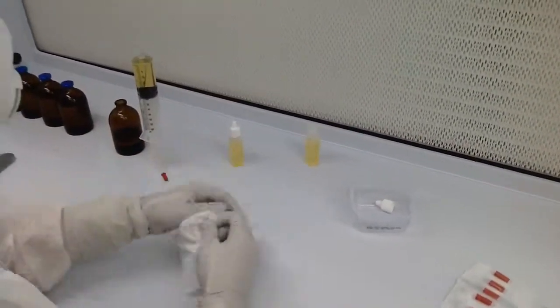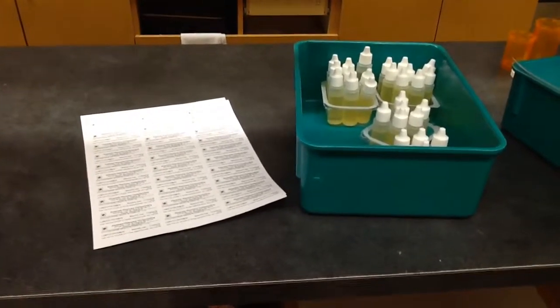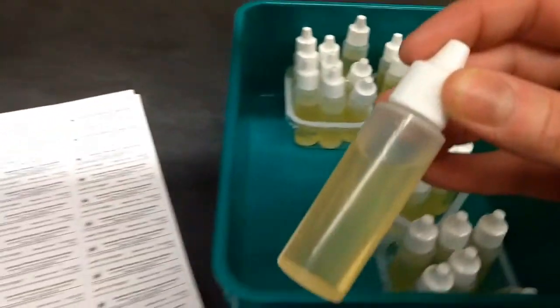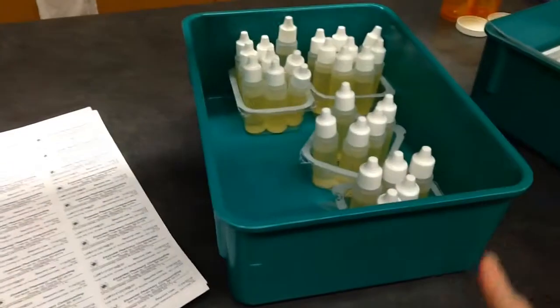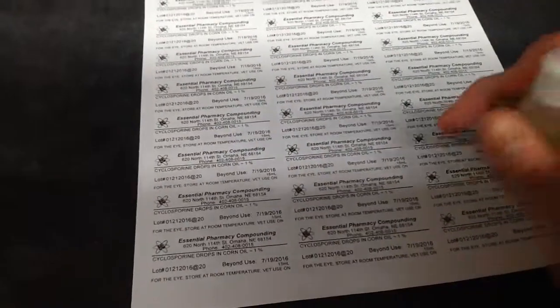Alright, and that's it. And finally, the last step for our ophthalmic solutions would be to take the ending product. Everything has been transferred into the 15 milliliter droppers, and we are going to label them. So we'll put a label on them, and then we also hold aside 2 of them so we can do sterility testing.